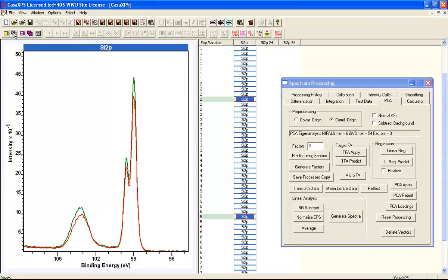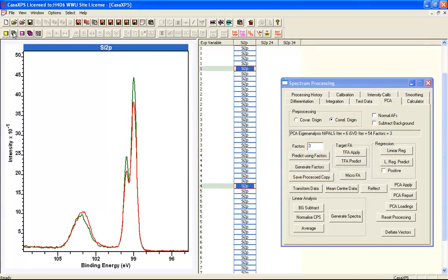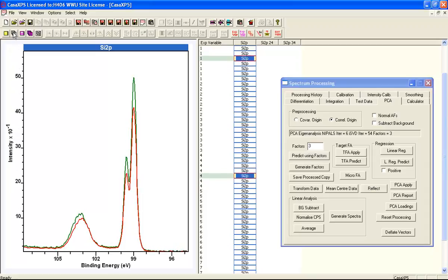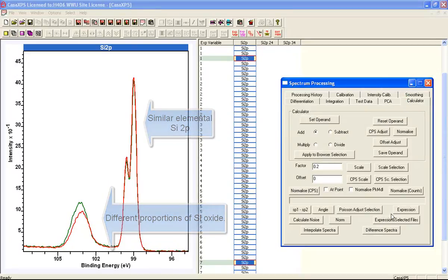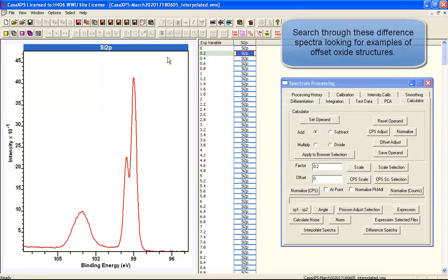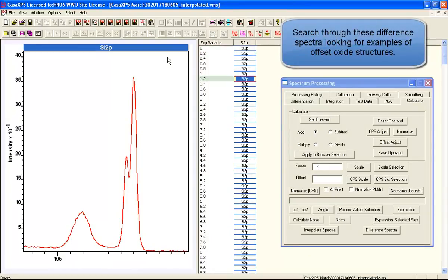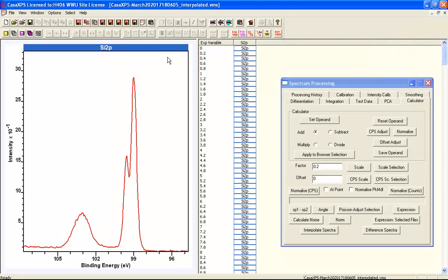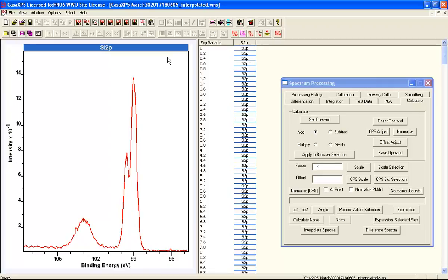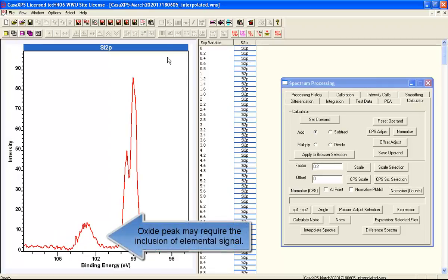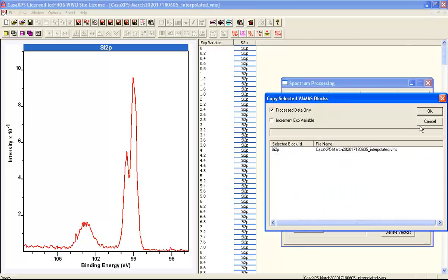Now we're going to look for another pair of spectra where we have similar elemental intensity with some variation in the oxide. This sometimes takes a bit of time to work out which spectra to use. But we've found two spectra that have very similar intensities for the elemental peak but a difference in the oxide peak. Using the difference spectra approach, we end up with a list of spectra we can search through. The elemental peak should always be in the same position, so we can pay attention to the oxide peak and try to identify two different forms of oxide.